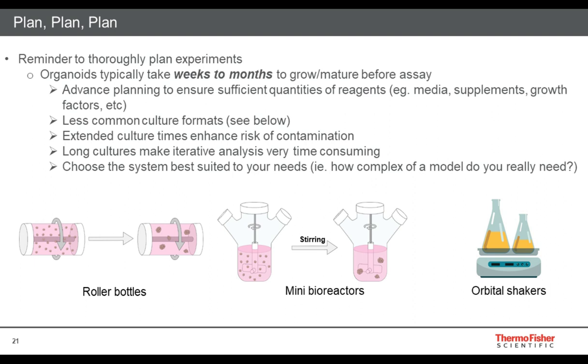They would grow on the order of days to maybe a week or two, depending on what model system you're using and how large you're trying to have it grow. But typically in the organoid space, protocols last anywhere from several weeks to potentially many months before they're at an endpoint where they're useful for assaying.